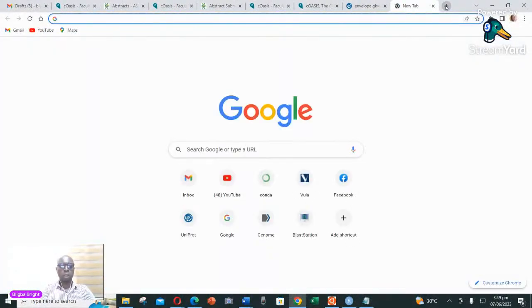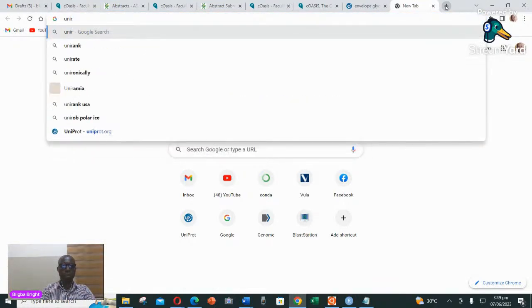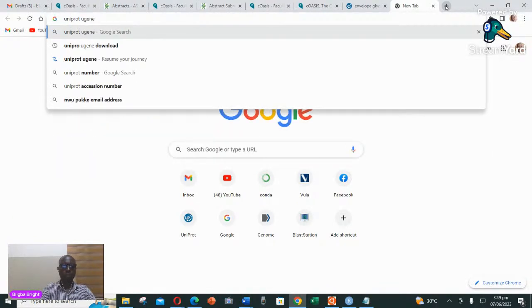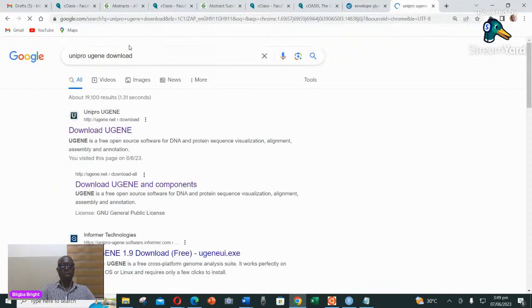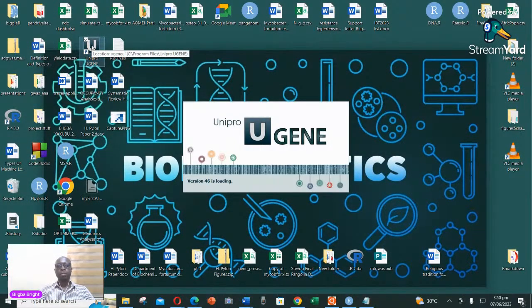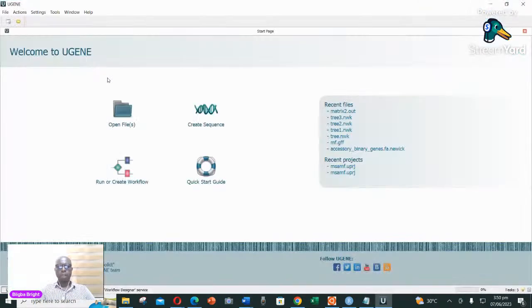Just go to Google and search for Unipro UGENE download. You can see the download here, and it's going to send you to the link. You can just come here, download it, and then run it as an administrator. Click next, and everything will be downloaded. When you download, you're going to have it on your desktop, like I have mine here. So I'm going to double click and launch it. It's opening right now, so it is ready.